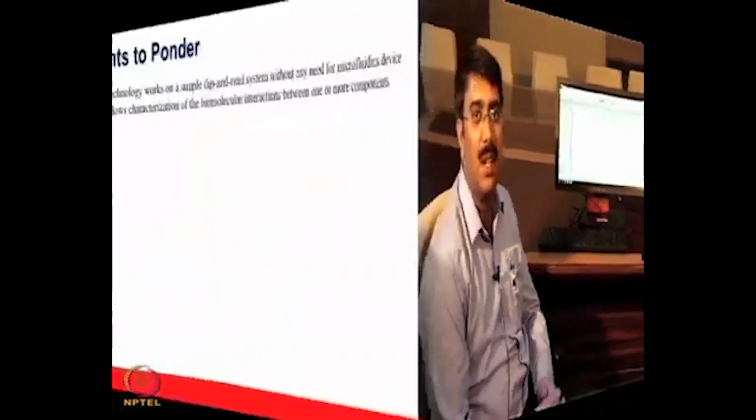Now we have successfully demonstrated the protein-protein interactions here, with protein A and the mouse monoclonal antibodies we used, and we got very good data with the 1:1 binding model, with an affinity of around 1.7 nanomolar. So with this I am concluding my demonstration.